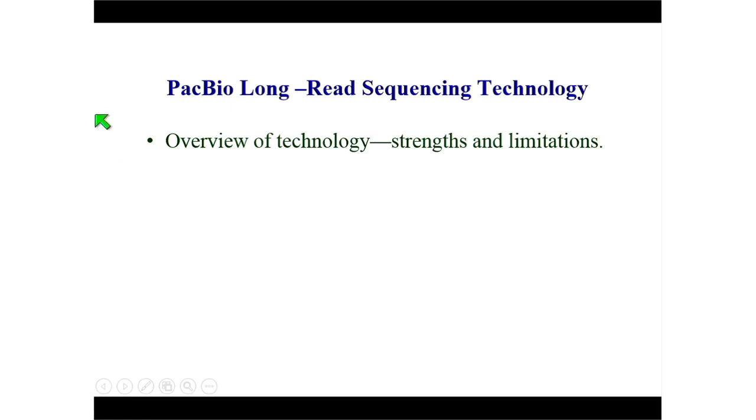So long-read sequencing technologies is what I'm going to be talking about today, and I'm going to be specifically focused on PacBio. My disclaimer: I am not invested. I am not on the SAB. I get nothing from PacBio. So I'm presenting this data to you from the perspective of a scientist interested in both basic and clinical research. I plan to talk about both the strengths and the weaknesses of this technology.